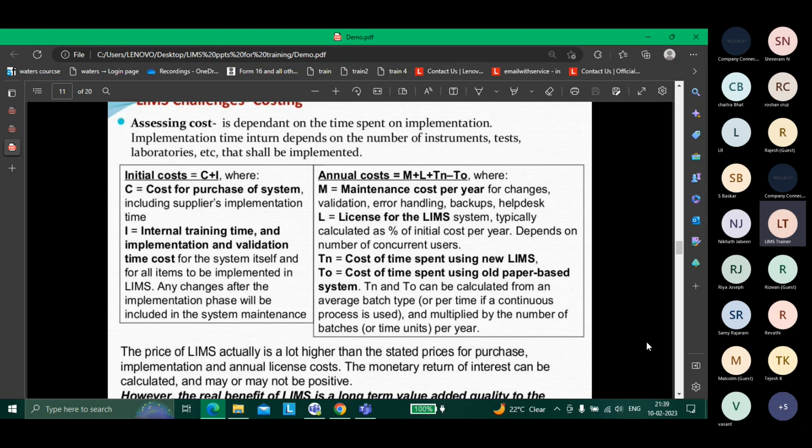It's not only practice, it's understanding what flag is doing what. Apart from practice, read the manual, what is doing what. Again, going through the manual. If something does not come to your mind, understand the code, how the table structure is built, how queries are built, how the automation scripts are built, what the functions are.